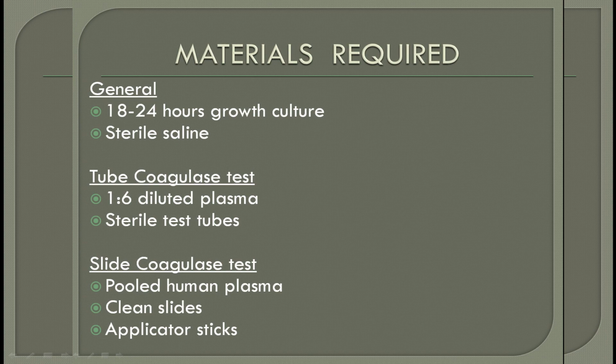Saline ensures that no other bacteria can interfere with the test, but Staphylococcus can actually grow even in saline. So that isolates the staphylococcal bacteria, and we can confirm it. Otherwise the test might be false positive, false negative, whatever might happen, other bacteria might interfere, right? That's why you need saline.